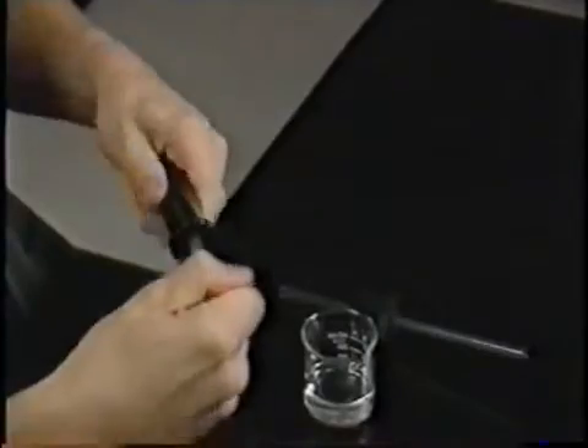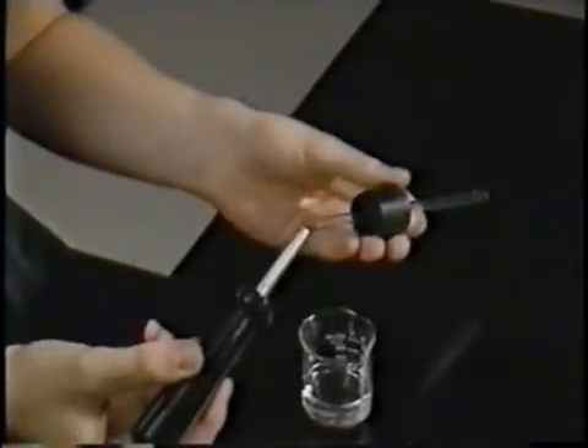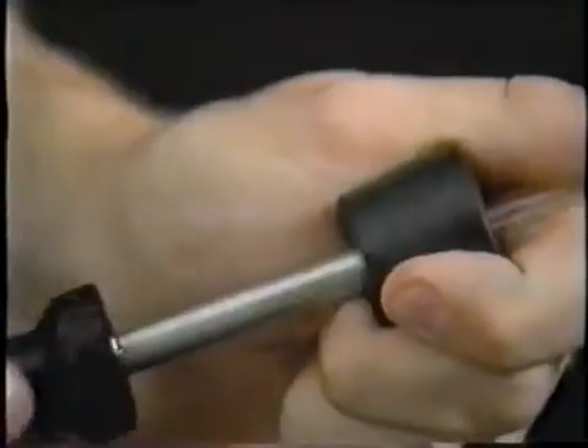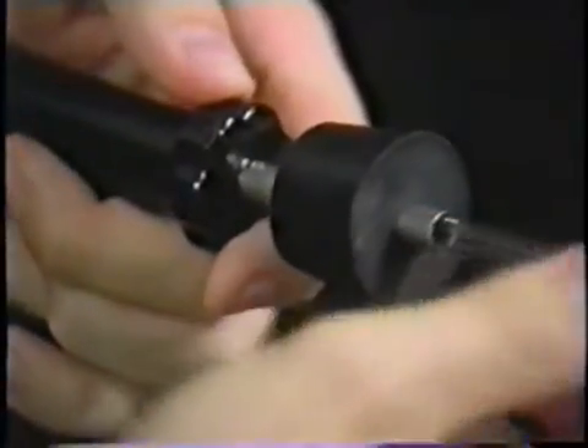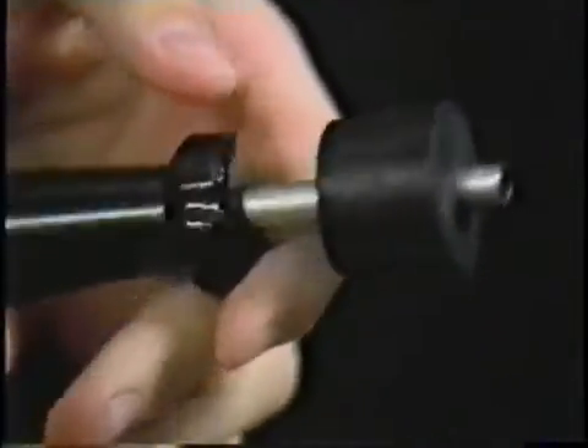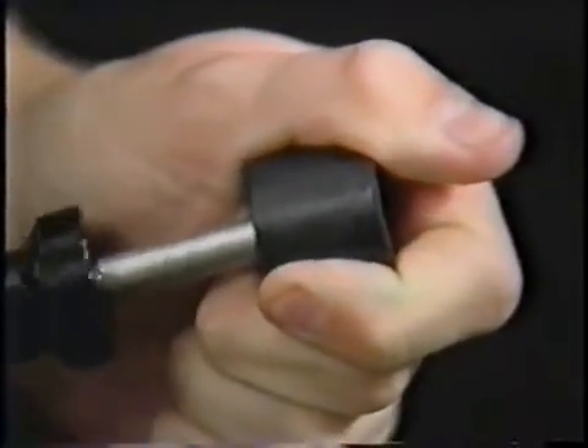To remove the tubing, take out the tip and lubricate the end of the hollow shaft. Push it through the stopper hole around the tubing, then slide the tubing out through the shaft and remove the inserter. Remember to wash the lubricant off before returning the stopper and tubing to storage.